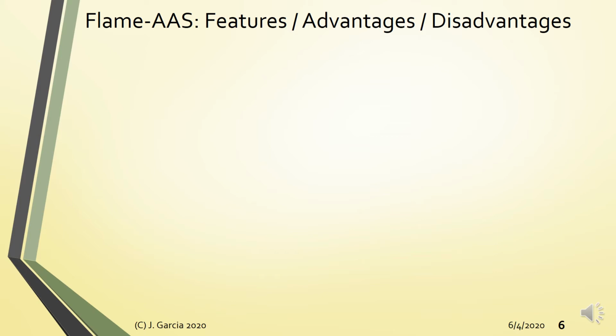Here are some of the features, advantages, and disadvantages of Flame AAS. First, this is quite reproducible. This is one of the major advantages of Flame AAS over the older turbulent type burners. It's very reproducible. However, not efficient.